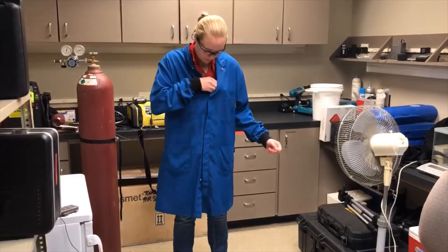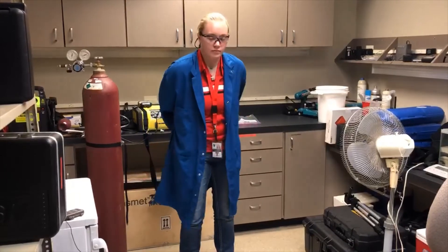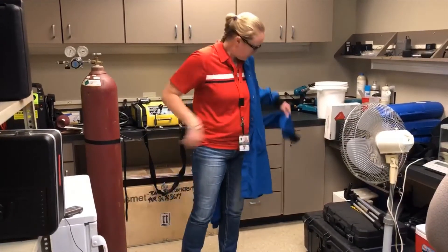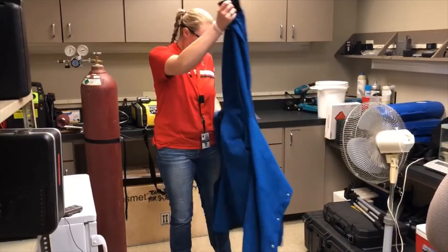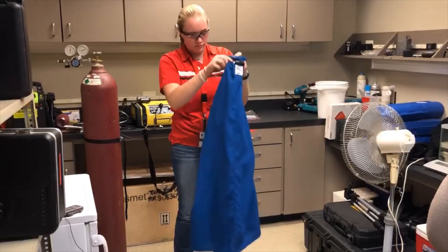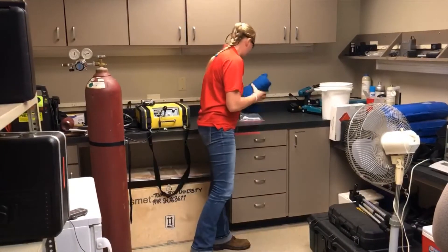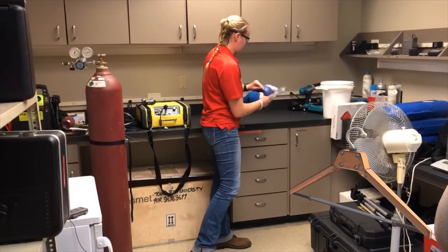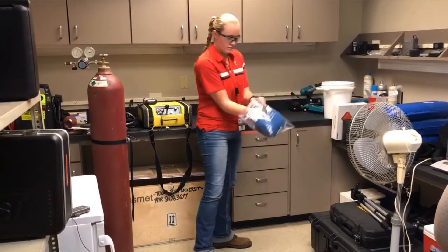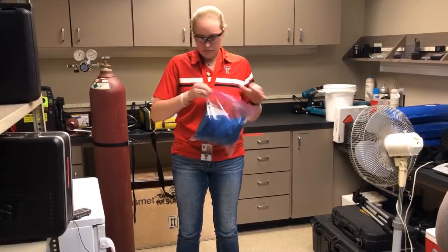When removing body protection, always ensure that you touch only the interior surfaces of your laboratory coat. This helps prevent contamination on your hands. Whenever you remove your coat, make sure that you store it appropriately. This can either be on a lab coat rack by itself, a hanger by itself, or you can fold it inside out and store it inside of a sealable plastic bag.